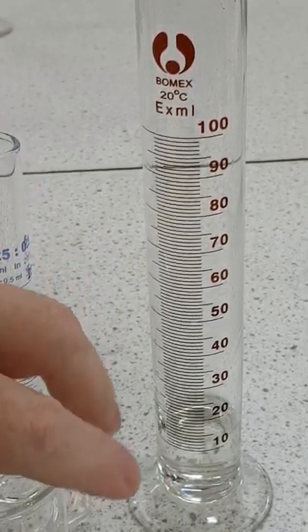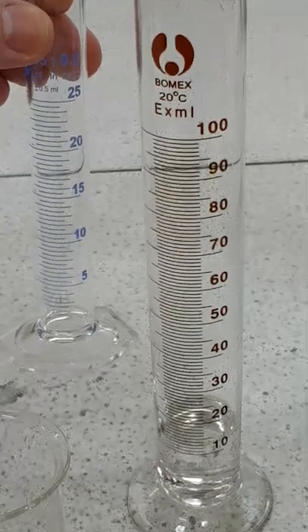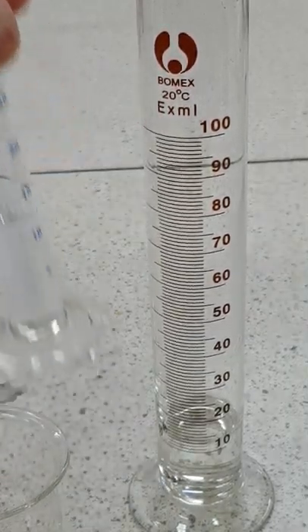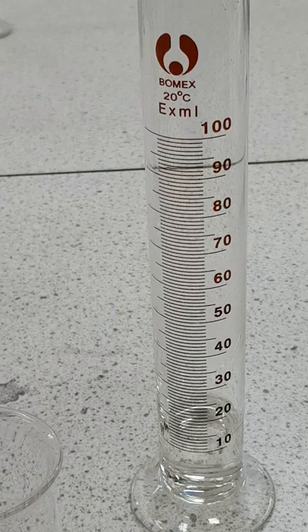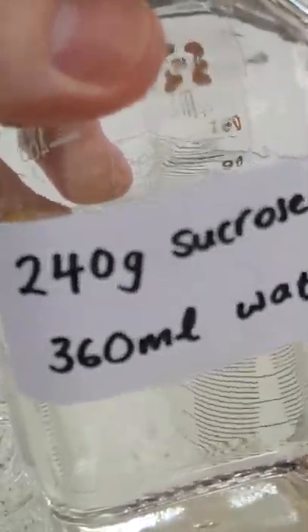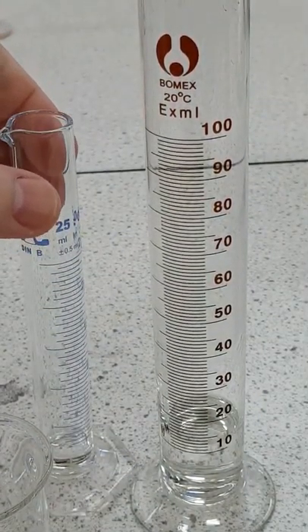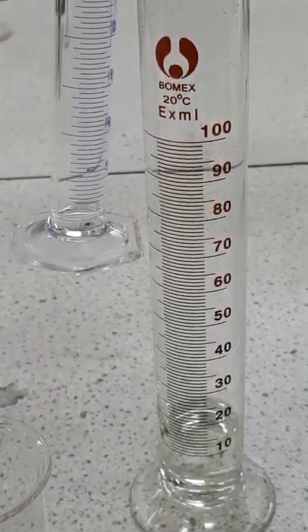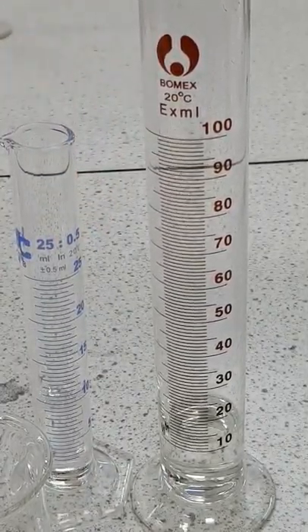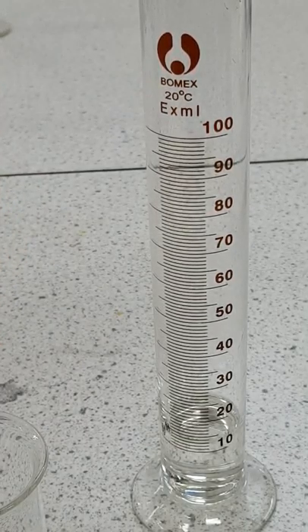Our next layer is quite complex, so we'll mix it in the beaker. We start with 10 centimetres cubed of the same sugar solution — 120 grams in 90 centimetres cubed of water — into the beaker, followed by 10 centimetres cubed of another sugar solution prepared by dissolving 240 grams of sucrose in 360 centimetres cubed, which is equivalent to 60 grams in 90 centimetres cubed of water. We add that to the first solution in the beaker.